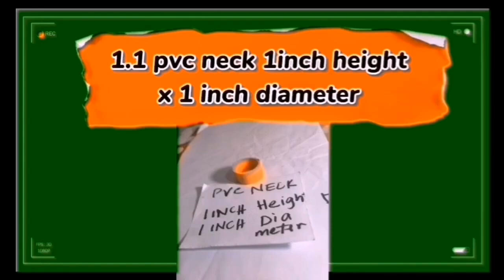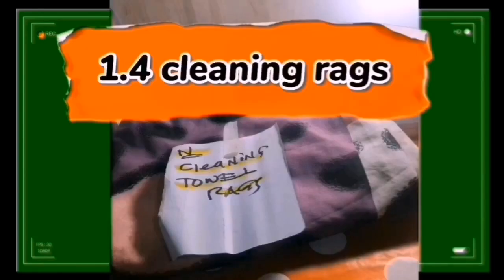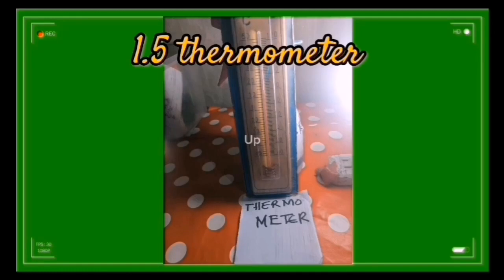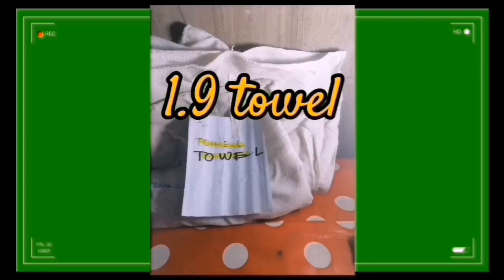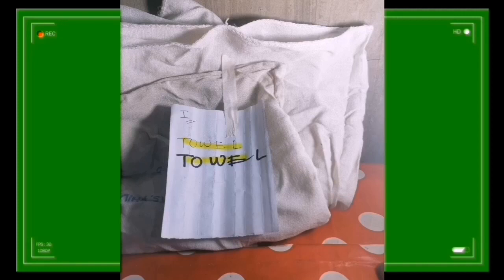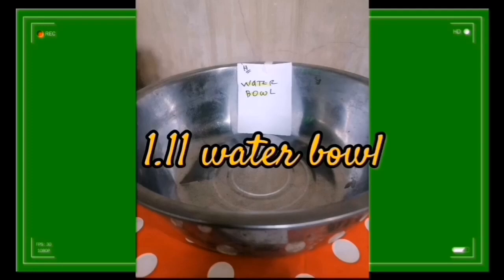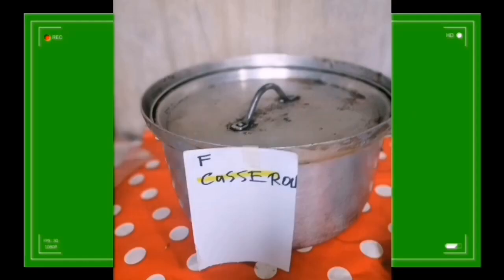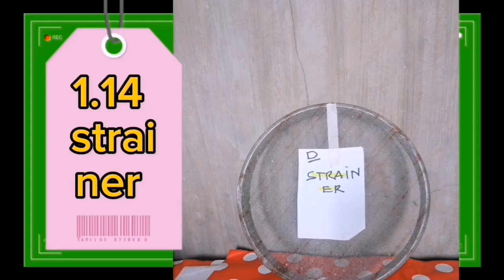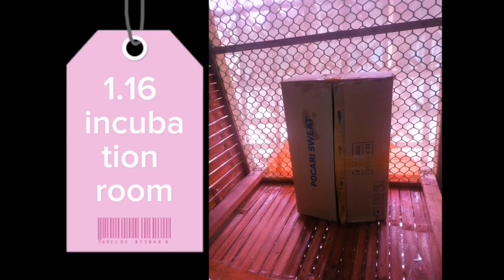Step 1: Materials. 1.1 PVC neck, 1 inch height x 1 inch diameter. 1.2 PP bags. 1.3 kerosene stove. 1.4 cleaning rags. 1.5 thermometer. 1.6 sub-on. 1.7 zonrox. 1.8 hydrogen peroxide. 1.9 towel. 1.10 70% alcohol. 1.11 water bowl. 1.12 scale. 1.13 casserole. 1.14 strainer. 1.15 pressure cooker. 1.16 incubation room.